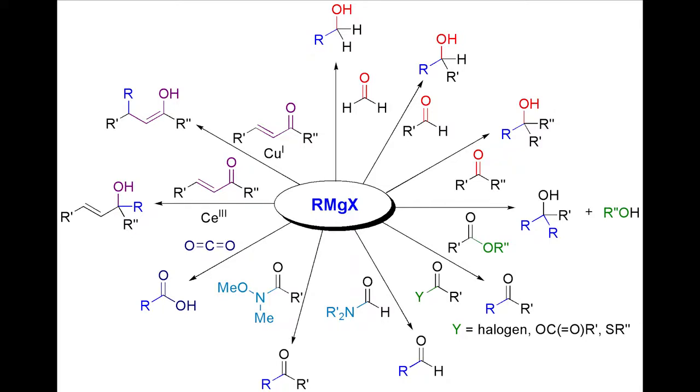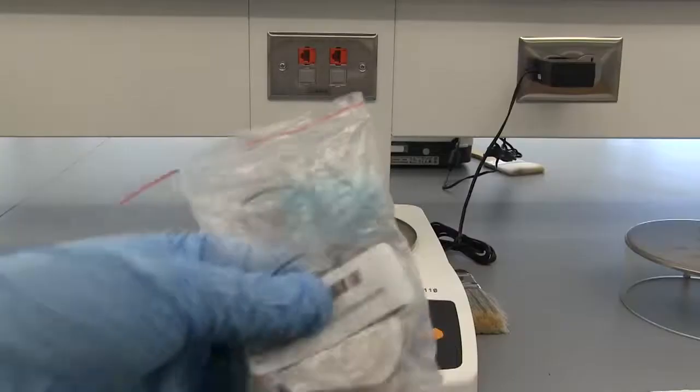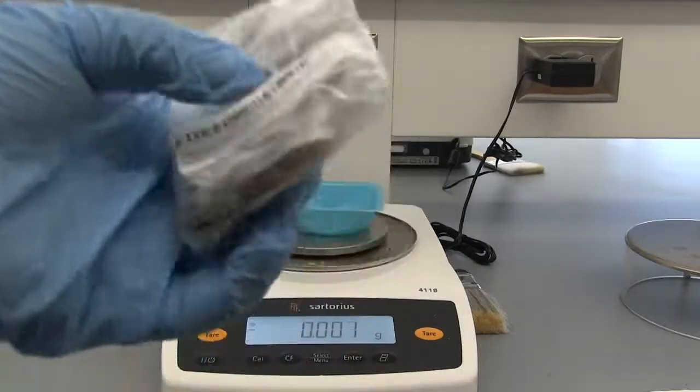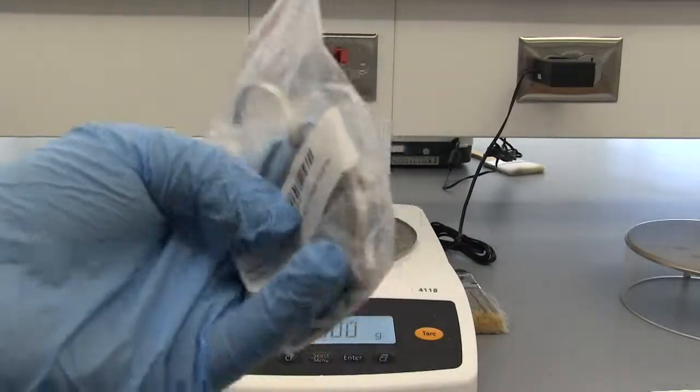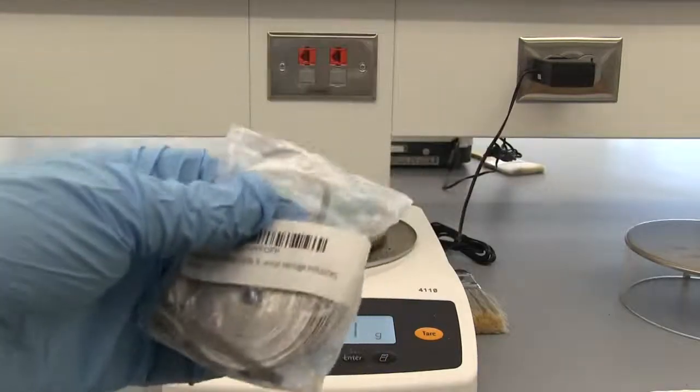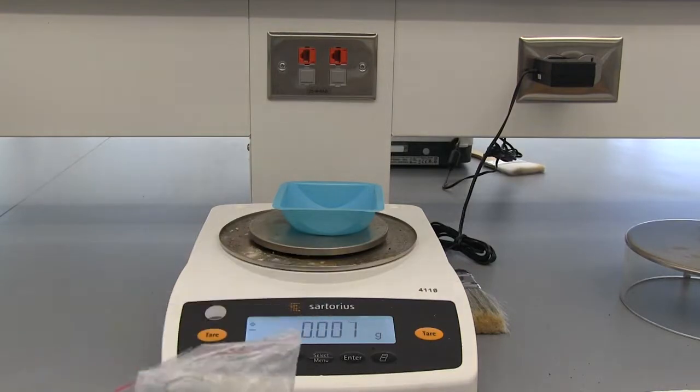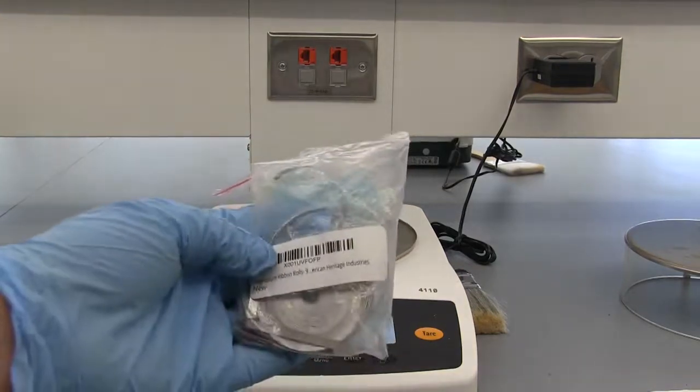And so to start the experiment, we'll need a 25-milliliter round-bottom flask that is as dry as it can be. So we need about 100 milligrams of our magnesium strip. I'm going to go and cut off some pieces. You may notice in your magnesium that it has some darker spots or some discoloration. That's some oxidation happening. We will sand that off as best we can. But let's go ahead and get our initial 100 milligrams.